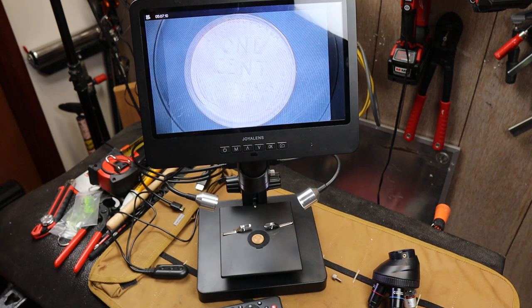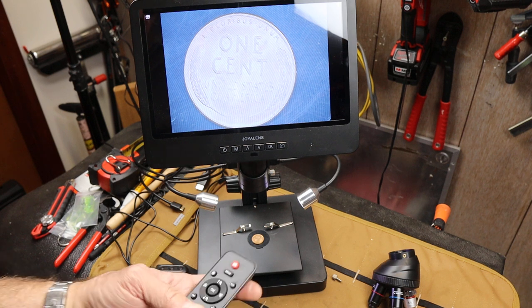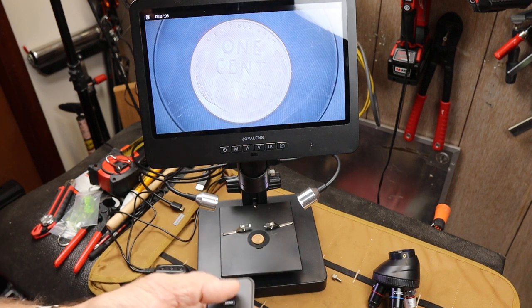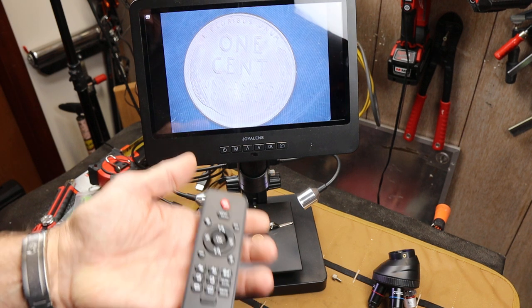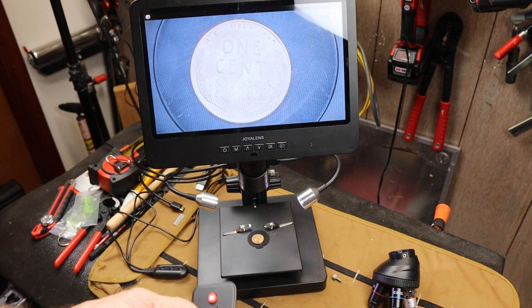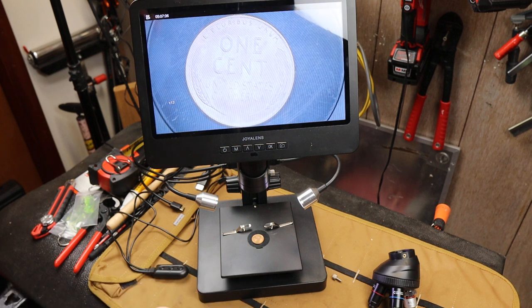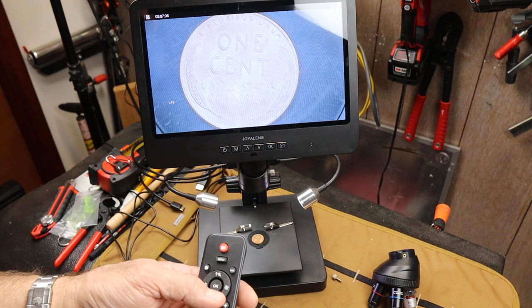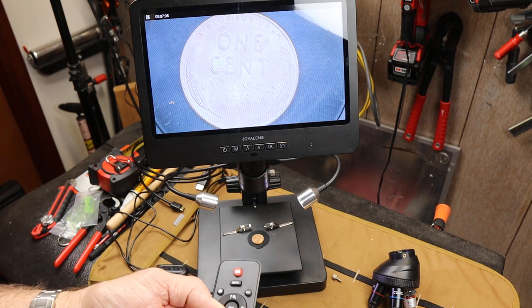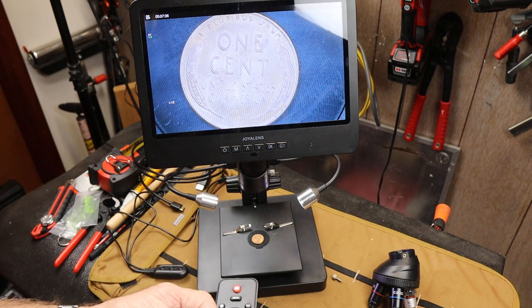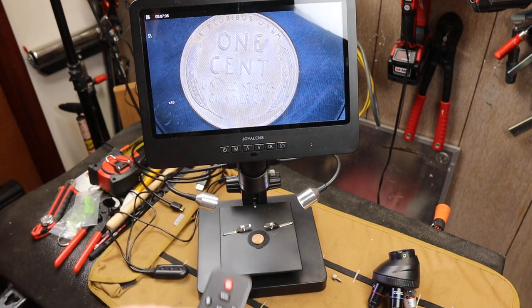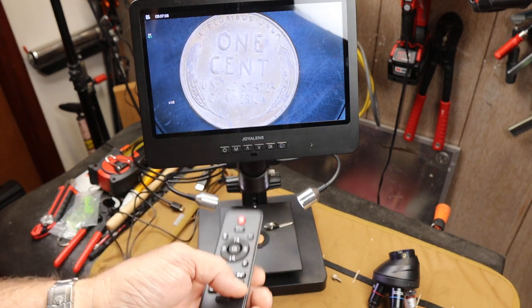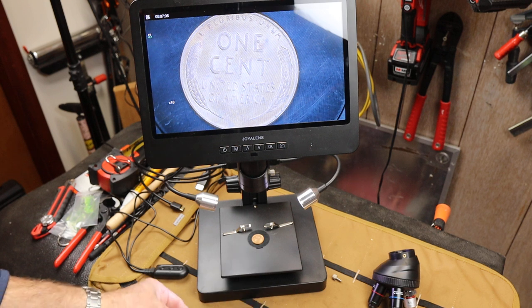I can take a picture here, right there. I can also use the remote that it comes with if I want to take a picture. I can zoom in with the remote as well, and I can adjust the lighting. If I want to zip back to the standard lighting, I can just hit the default, it brings it back.